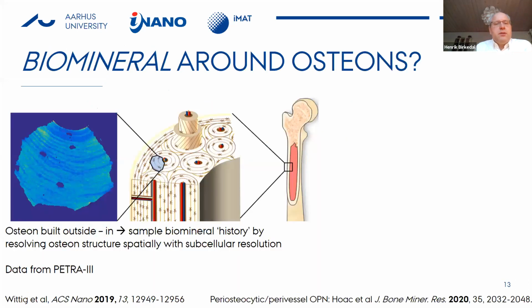So that told us a lot about the osteocyte lacuno-canalicular network itself, but it does not tell us so much about the surrounding mineral. And so to do this, we would use diffraction. As a first example, I would just show you a larger scale experiment, and then we will increase resolution to go closer to the osteocyte lacunae themselves. So in this experiment, we looked at osteons, and osteons form by the carving of a tunnel, which is then filled from the outside in.